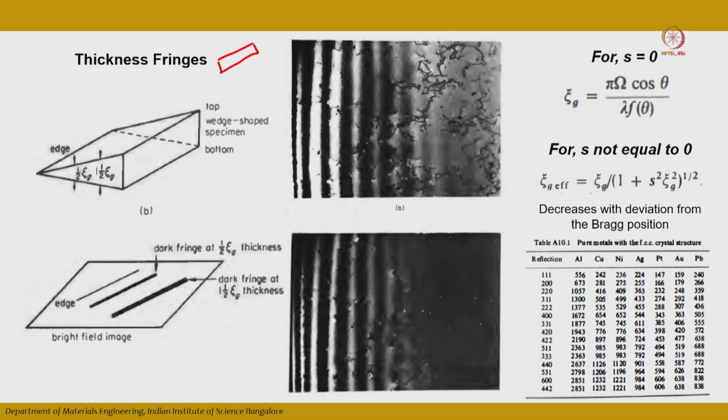Okay. It is possible that at the edge of your sample, the thickness changes as you go away from the edge, correct. So consider this schematic, where a sample edge is shown with the thickness varying as you go into the sample. This is your z.